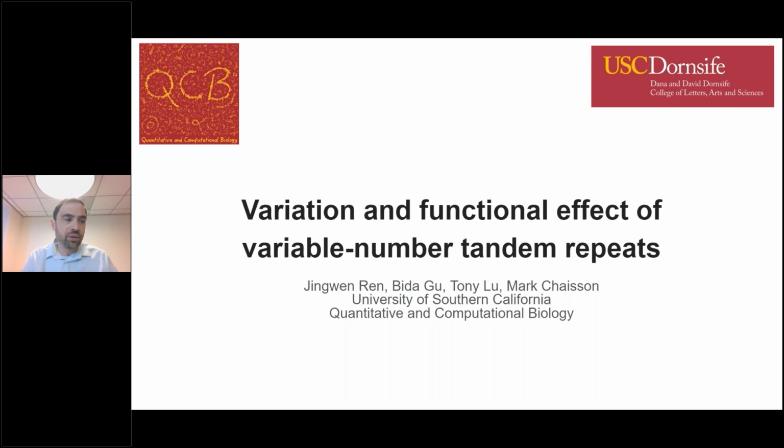I know a lot of you are here to see a talk on long reads. Unfortunately, some of the data is still coming out for long read sequencing. I'm going to tell a two-part story, one where we're making some inferences on what we could potentially find with short read data. And then I'm going to talk about a tool that we've developed for carefully annotating tandem repeat variation with long read data.